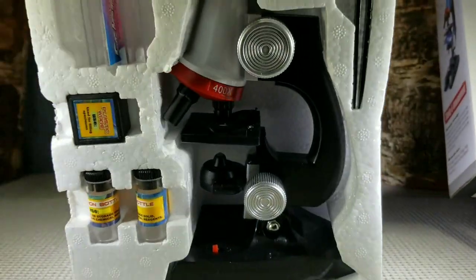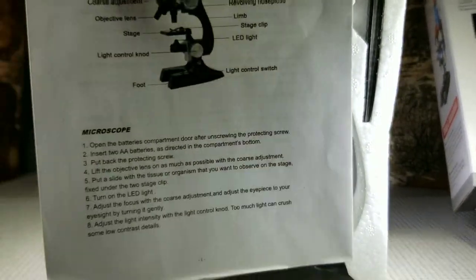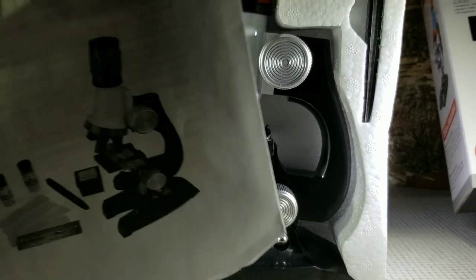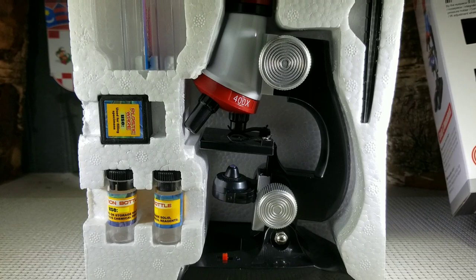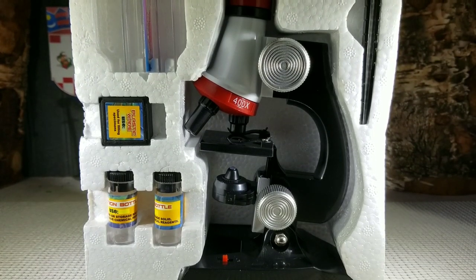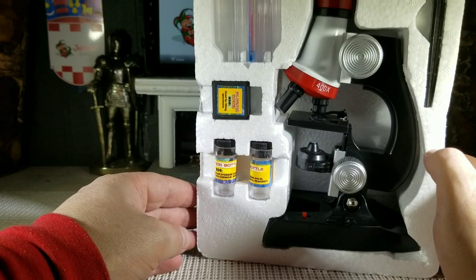Inside you get a few items. You get your instruction manual. And here is the microscope — it is a cute little set.